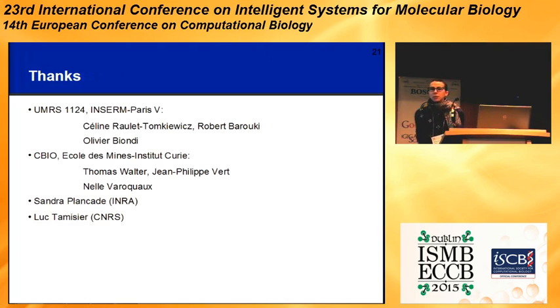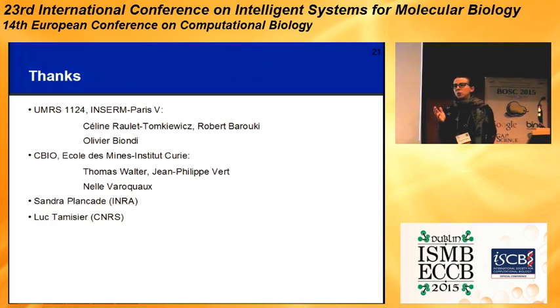How well does your cell tracking cope with cell division? Sorry? How well does the algorithm cope with cell division? Well, that's the only prior information that you put. You allow that cells can divide, merge because of segmentation artifacts, appear, disappear, and do one-to-one. So that's hard-coded in the algorithm.